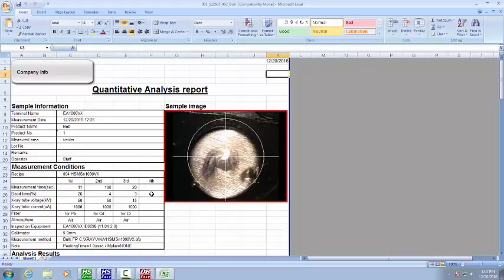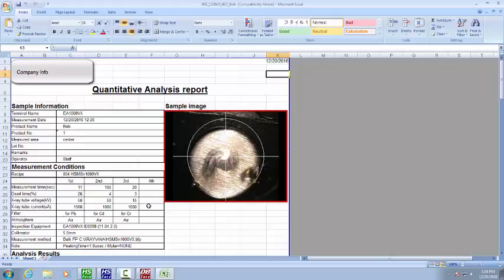All these, of course, are stored forever on the server and can be edited by supervisors. It can be drawn up by lot name, date, and so on. But they are automatically stored.